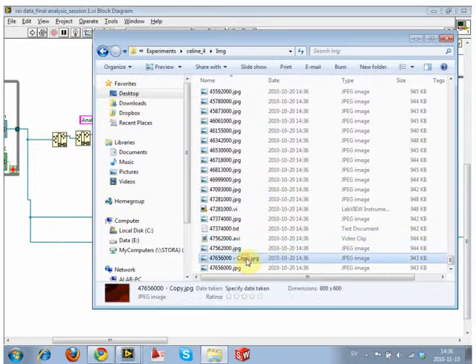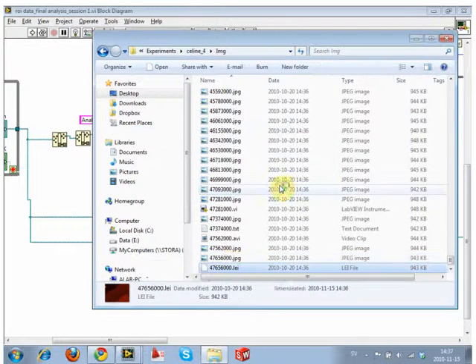Alright, so badly file-structured data would look like this, where they just threw it all in one bucket. Kind of like how I am with my desktop. Throw it all in one bucket and I'll fix it later. For handling complex large data sets, it isn't the best way to do it. It's much better to separate out your data from your images from your analysis. That's because you want to keep them in the same parent folder, but you don't want them all stuck in the same folder.